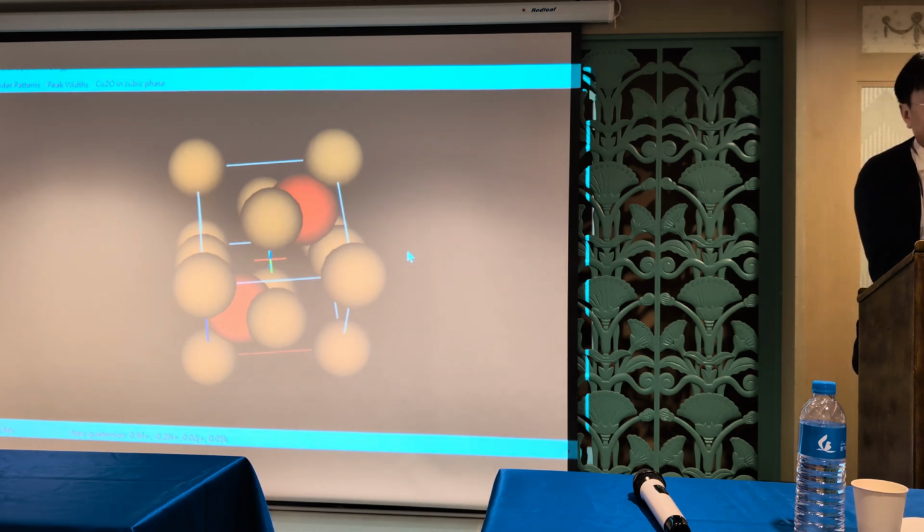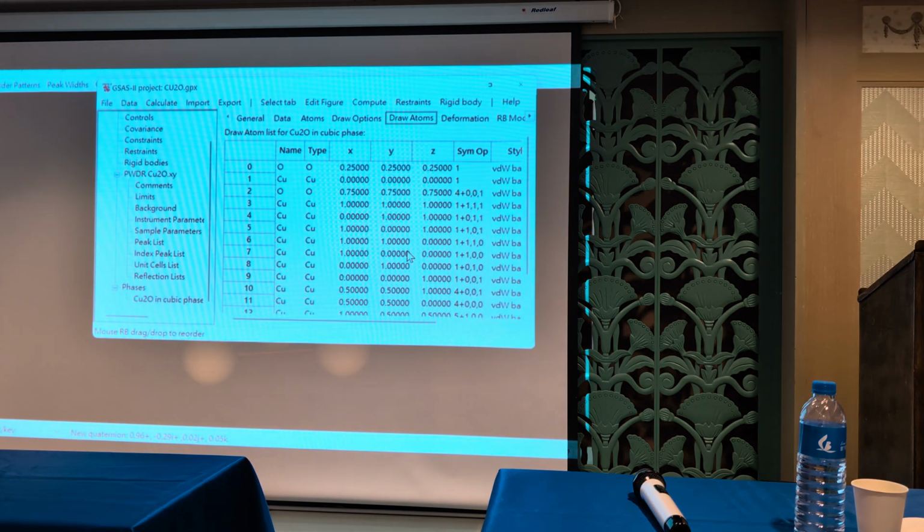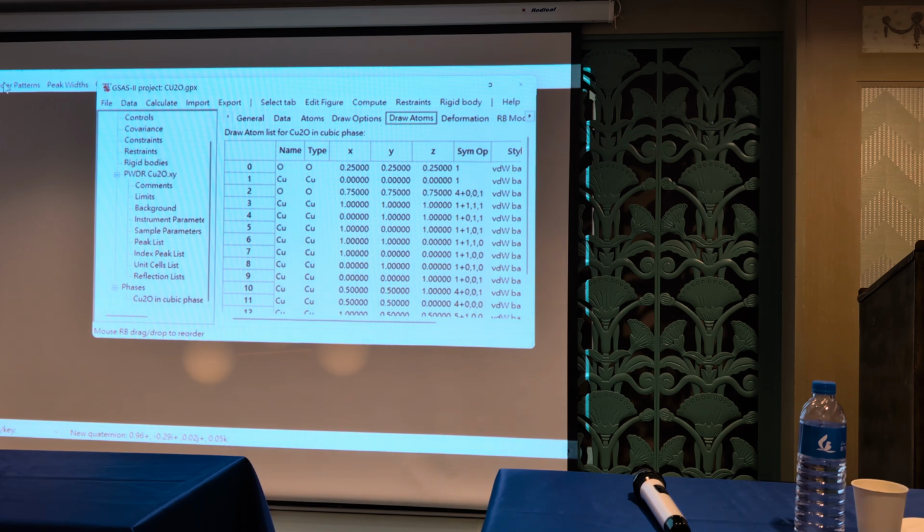那 diffraction factor 的影响在哪？啊，diffraction factor 的影响哈，我直接手动调数字给你们看，你们就知道 diffraction factor 实际上影响是什么哈。I will manually adjust the diffraction factor, and you will see the influence on the diffraction pattern.